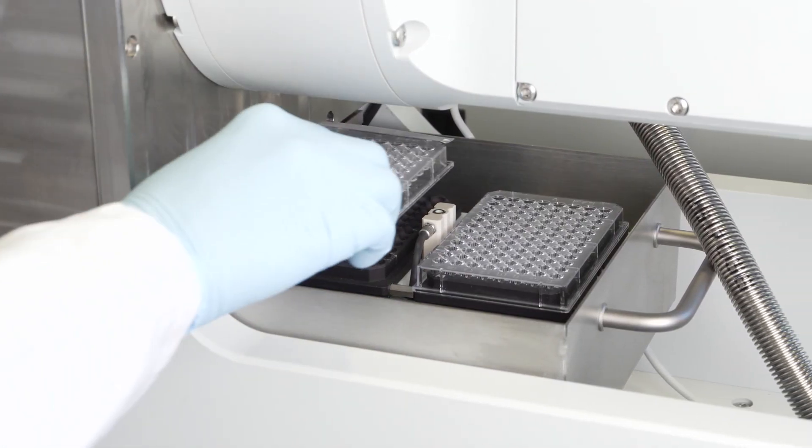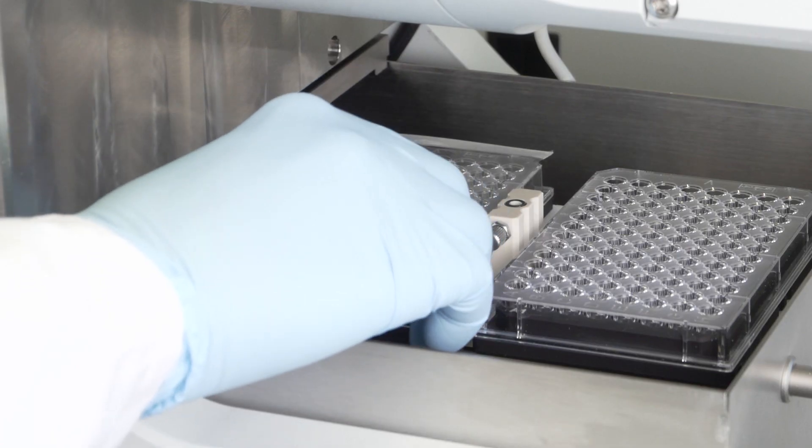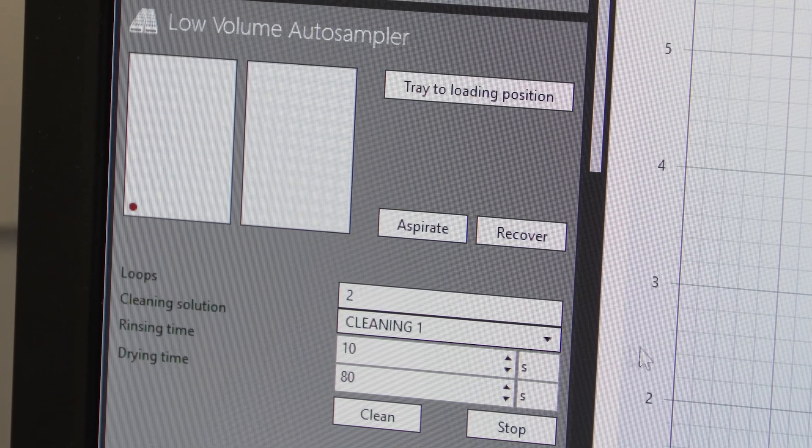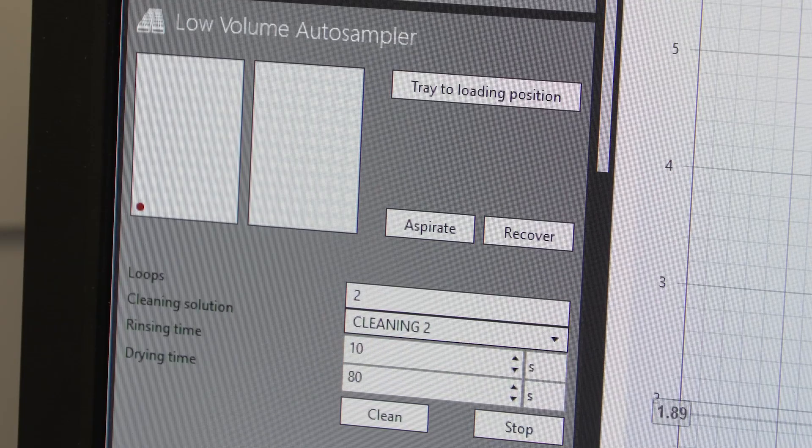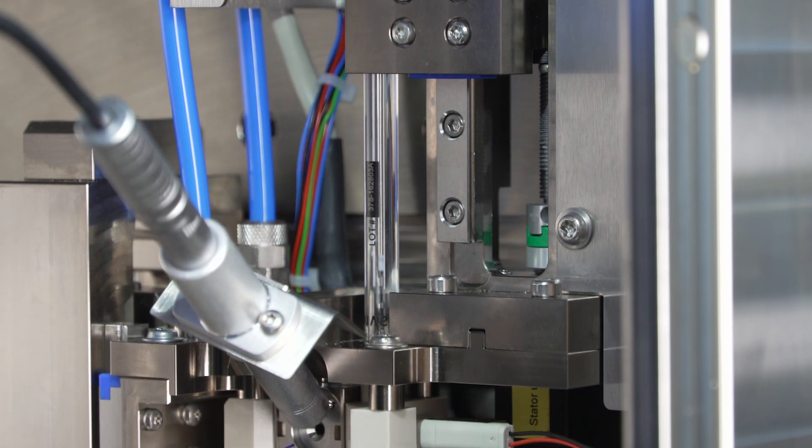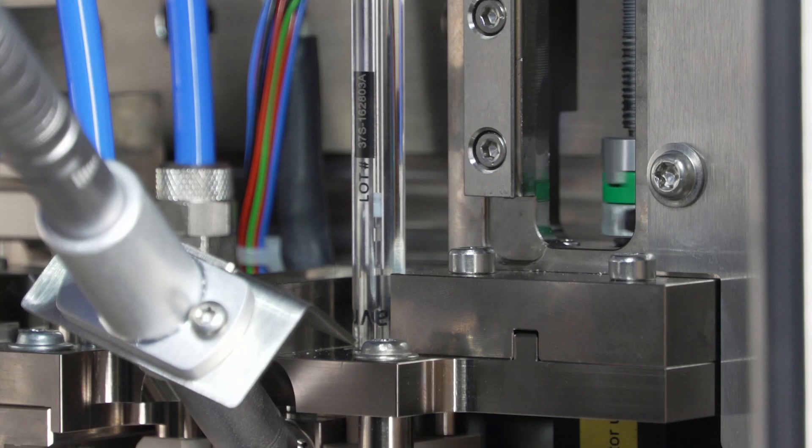Efficiency is in our DNA. We ensure you can process a whole array of samples. SAXSpoint 5.0 integrates auto-sampler solutions for liquids, pastes, powders, and solids. Processed automatically. Superb scattering data at the push of a button.